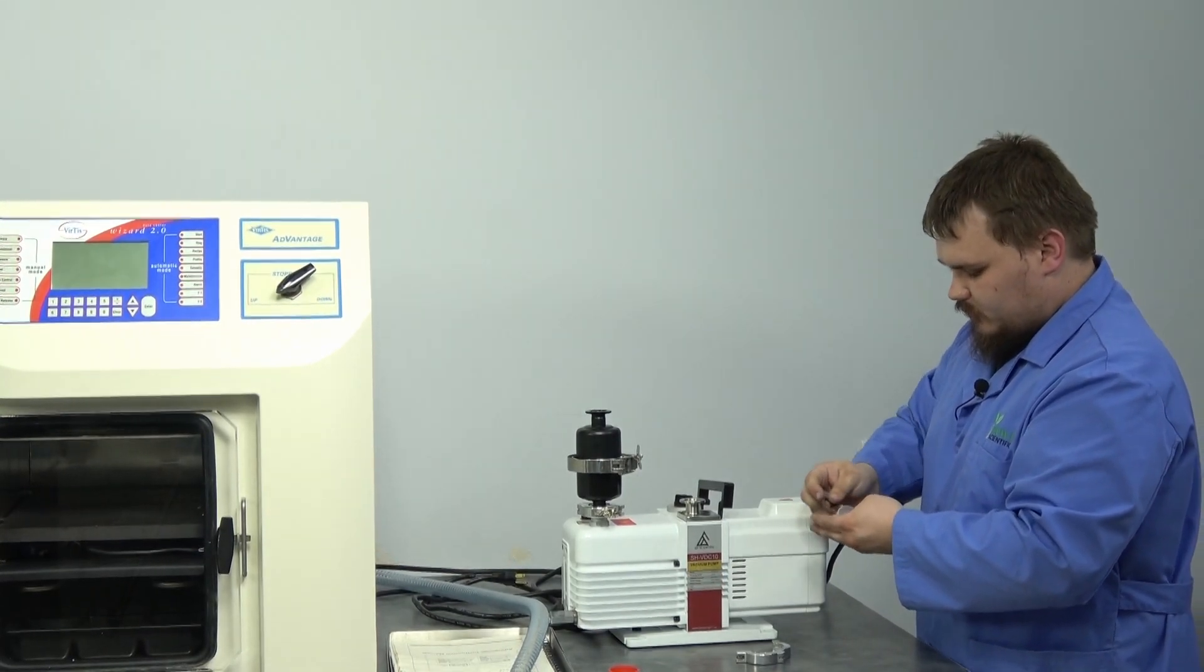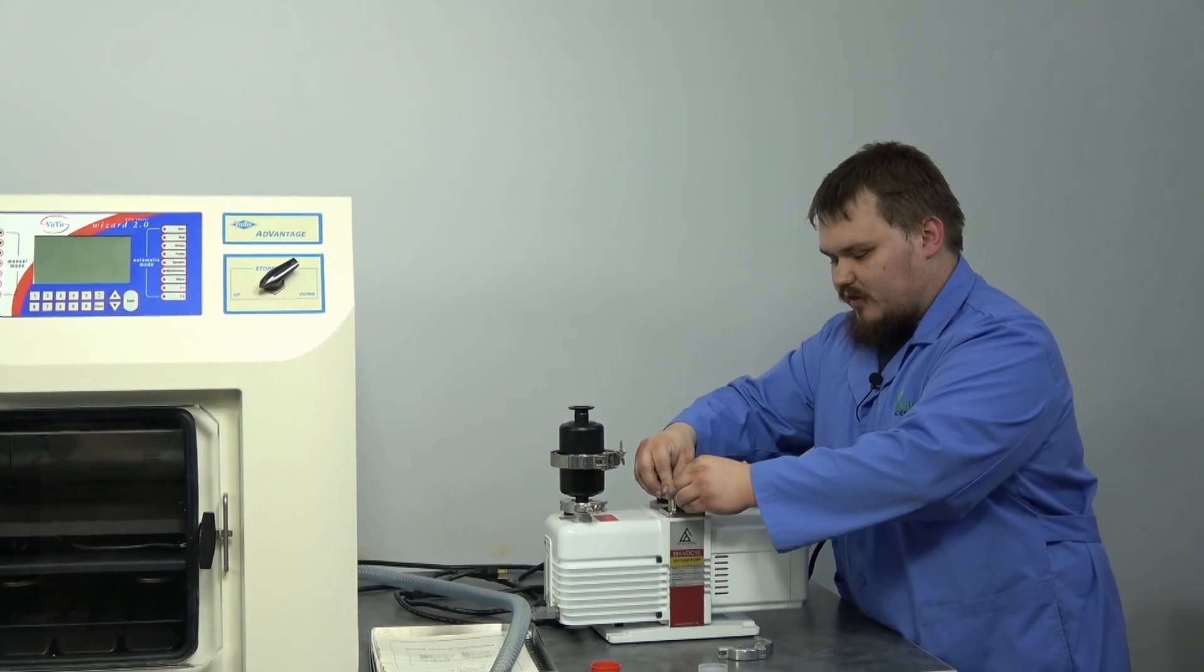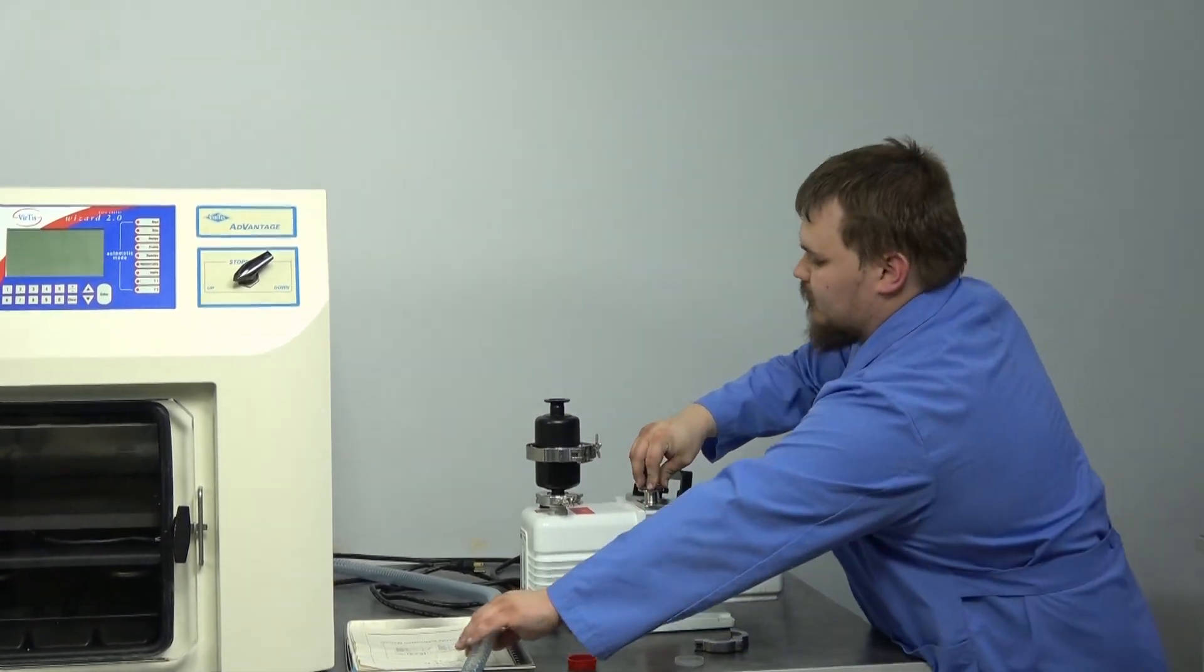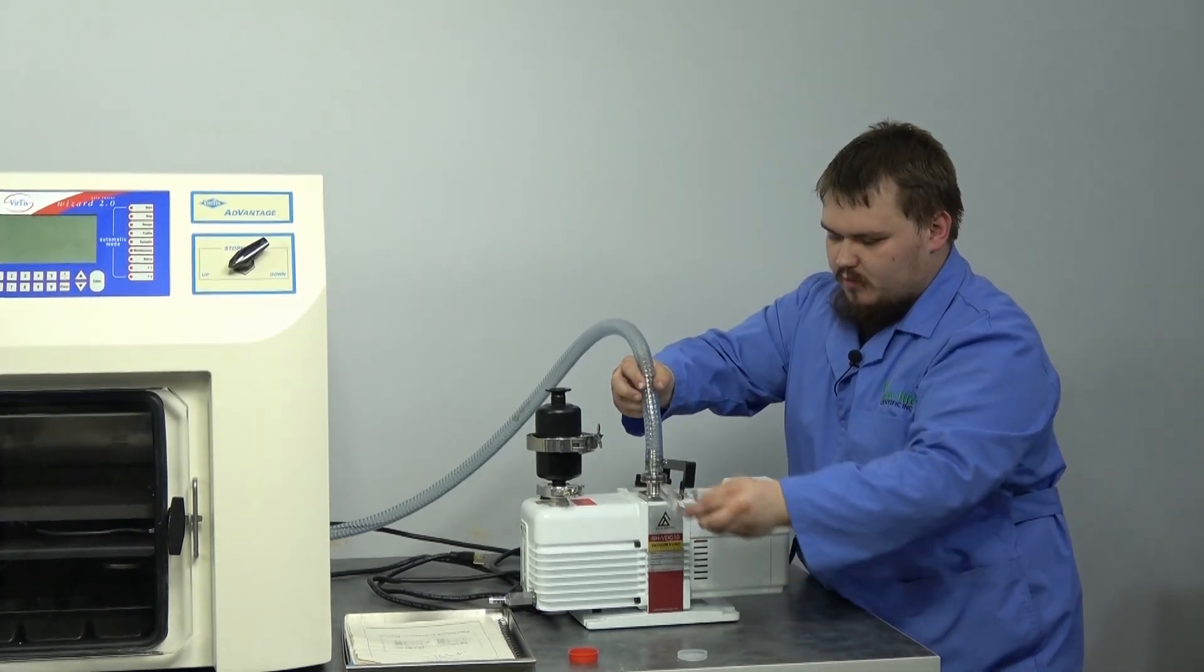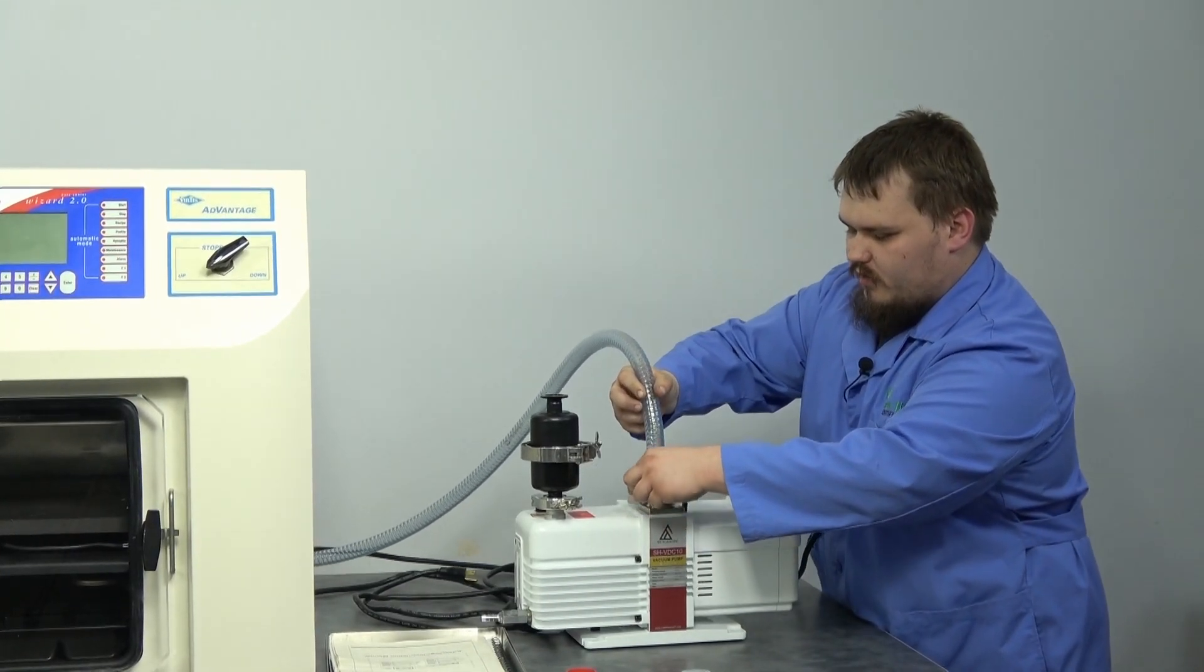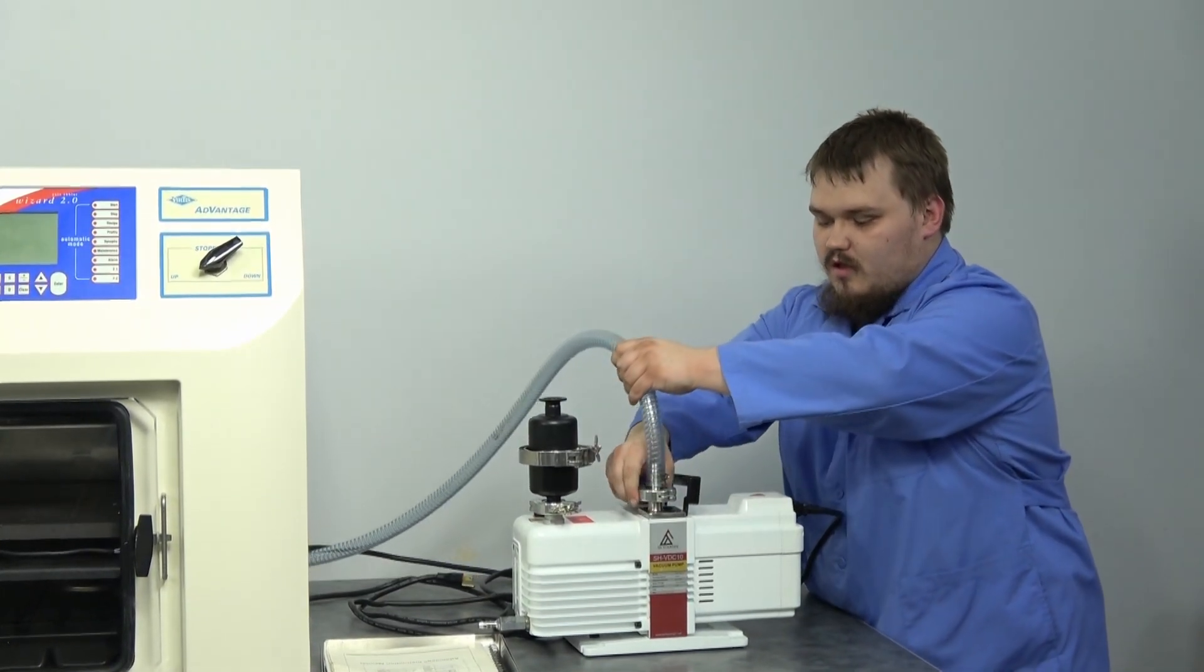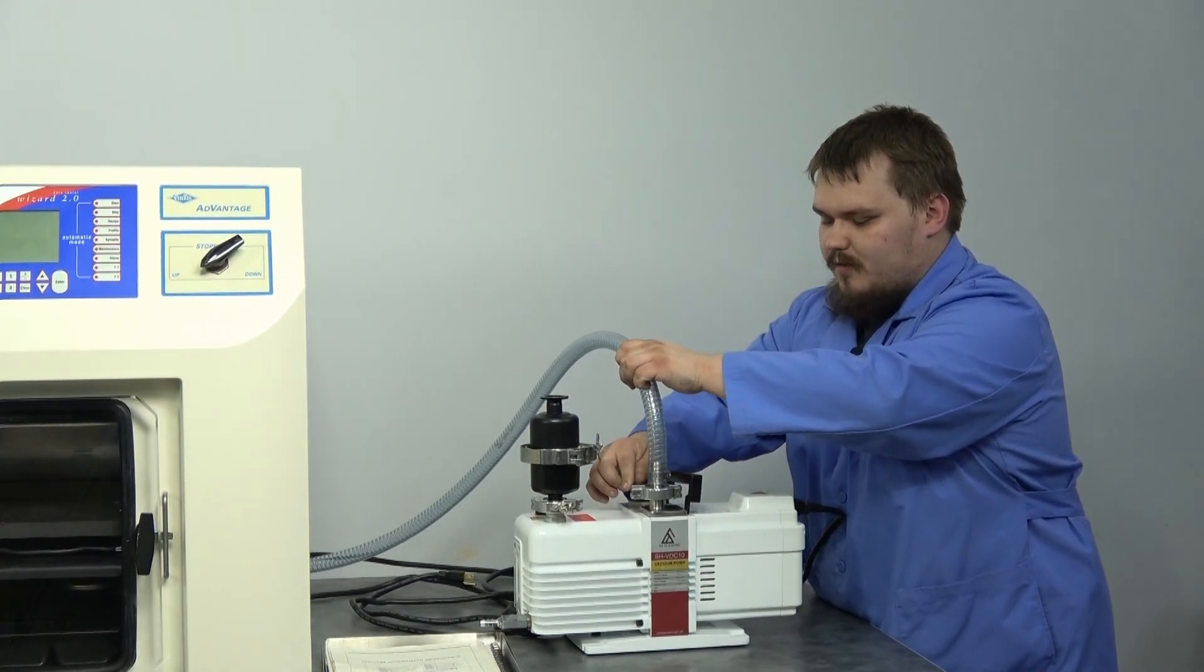Make sure to pull the seal out of the cap; it likes getting stuck in there. Place that seal right on top of the inlet of the vacuum pump. From there, put the hose down on top of it, put the connection on there for the clamp, and then tighten up the clamp.